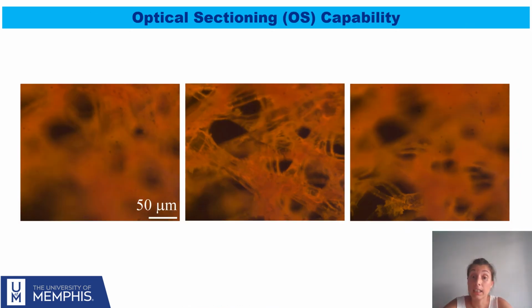What you're going to see happen with a conventional widefield microscope is that there are areas, which I'm highlighting right now, that are part of the object that is in focus, right? But there are other areas that are completely blurred.